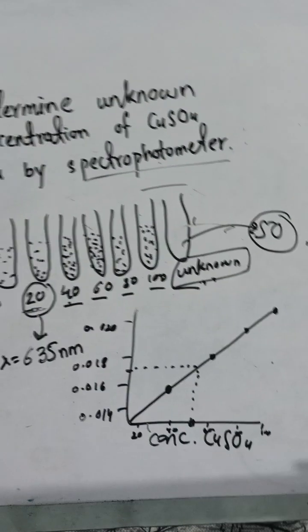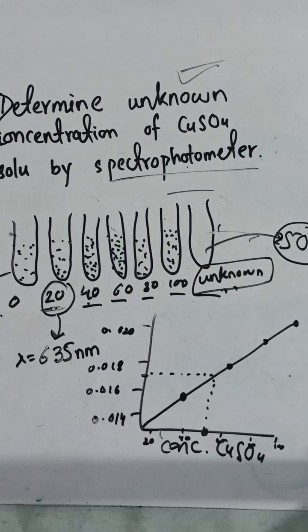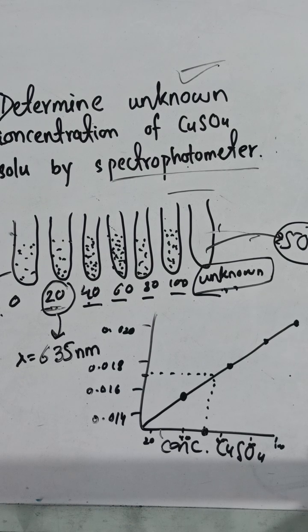So our major purpose in this experiment is to find out the unknown concentration. Okay, other concentrations are given to us, and by knowing the concentrations of the others, we have found the concentration of that substance which is unknown to us, and we extrapolate the graph of them. We will check their absorbance, and then we plot that out.